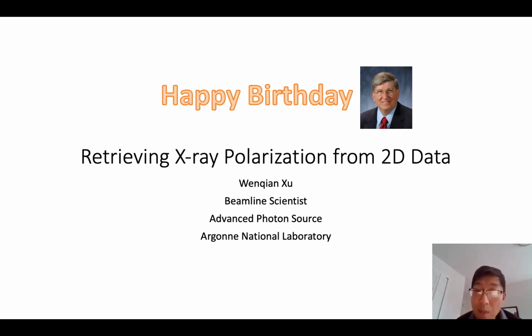I'm very grateful to have been working with you at APS for the last 10 years or so, and very thankful to the GSAS-II software, which is really instrumental to my beamline work. So today I'm going to talk about retrieving X-ray polarization from 2D data, which is a small but very useful function built by Bob, added to GSAS-II a few years back.